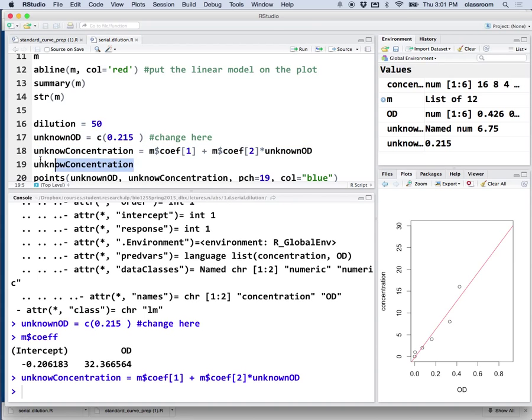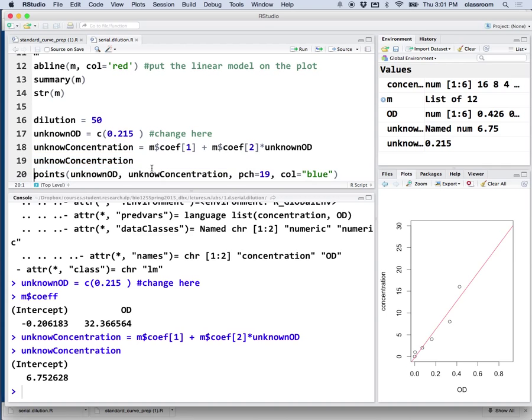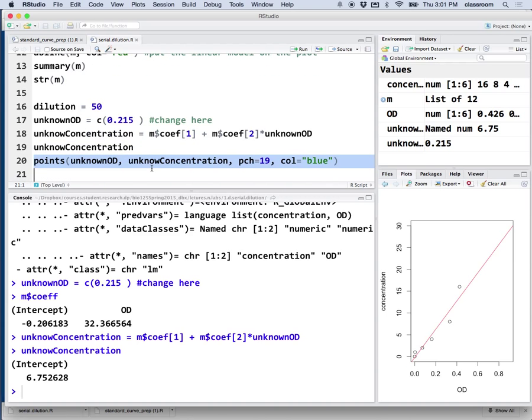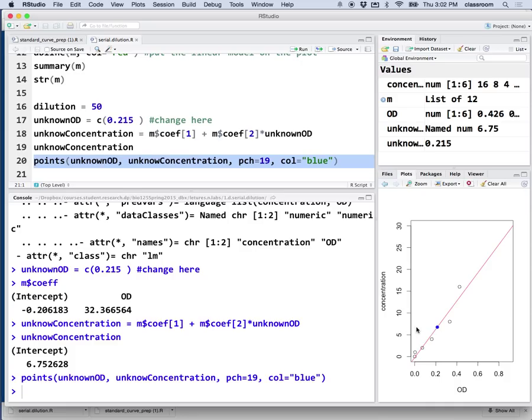So, this is going to give me the unknown concentration. In fact, this time it's called 6.75. And, we can also put this unknown on the plot. Right there. That's the, the blue dot is our unknown. It has the 0.215 with the concentration estimate about 6.75 microgram per microliter.